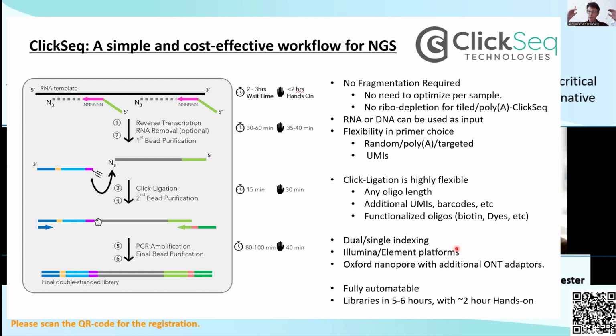And if you take that final library and add on the motor protein and the adapter proteins from Oxford Nanopore Technologies, you can also sequence on Nanopore platforms as well.